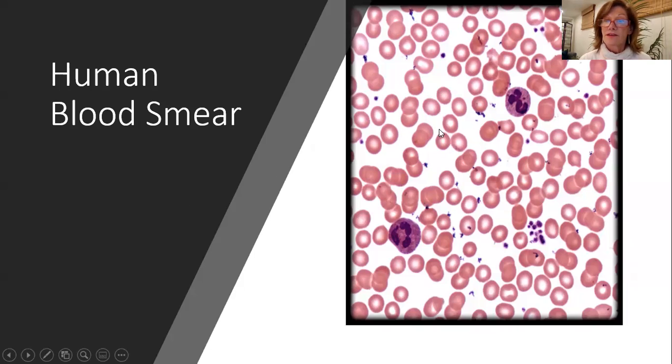red blood cells. And they're very easy to identify for three simple reasons. One, they're small. Two, they lack a nucleus. There is no nucleus in a mature red blood cell. And three, the cytoplasm in the center of the red blood cell is so thin that it hardly picks up any of the chemical dye, and therefore it stains clear, and it almost looks as if there's a hole inside the cell. Of course, there isn't. It just looks that way.